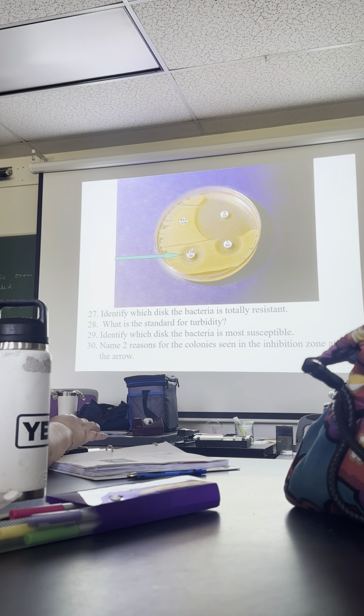Well, what's happening here? You have colonies inside a zone. It's a breakthrough. So true or false, you should use this antibiotic to treat infections? False. Not no, it's either true or false. You can't say no. Okay?